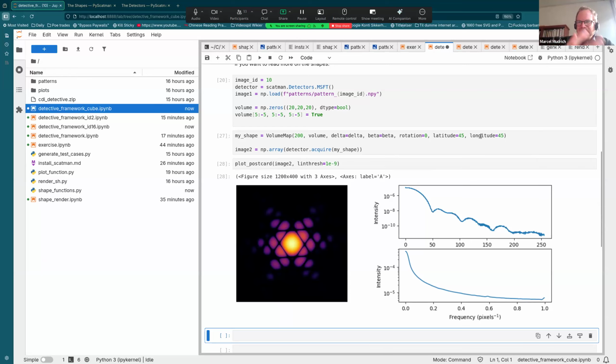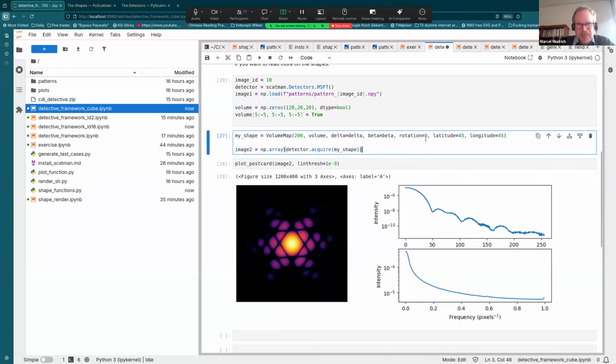To really get the full 3D distribution in real space. So that's why it needs this serial femtosecond crystallography. Just one projection, one diffraction image, is often not enough to allow for a reliable full 3D reconstruction.